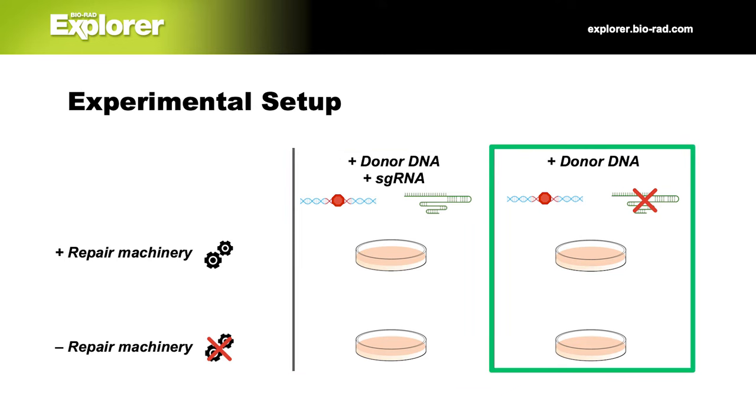In either case, be sure they're in the dark since XGAL is light sensitive. Keep your incubator in a dark room or drape some foil over them on the counter. Or you can loosely wrap the stacks in foil, but not too tight so that you don't suffocate them.